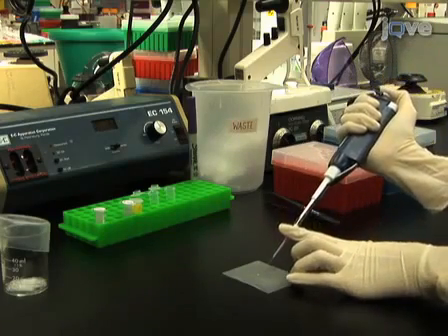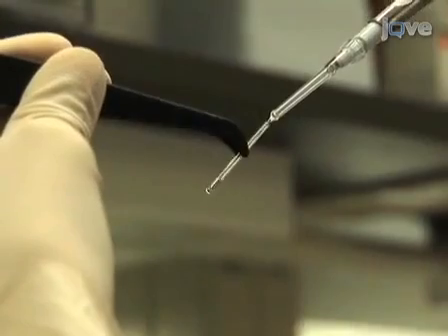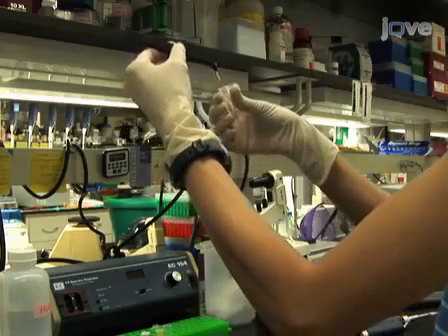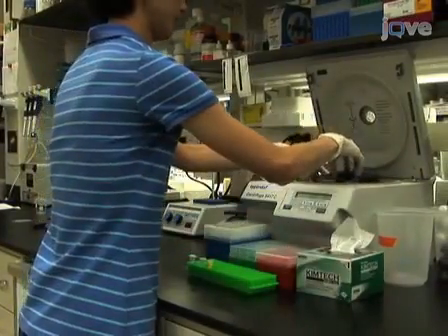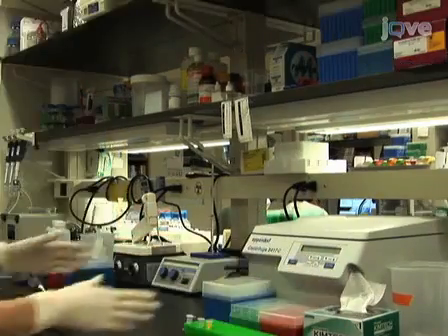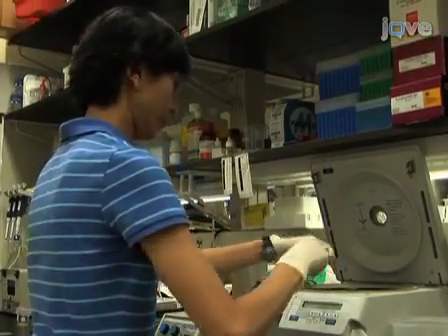In order to sediment any particles in the cDNA solution that may later block the microinjection pipette, use a microloader pipette tip to transfer it to a prepared hematocrit tube, which has been cleaned, cut, and flame-sealed at one end. Then place the hematocrit tube into a 1.5 milliliter microcentrifuge tube and spin for 15 to 30 minutes at 10,000 G's at room temperature. Once the centrifugation is complete, set the tube containing the cDNA injection solution aside. This solution can be kept at room temperature during the injection session.